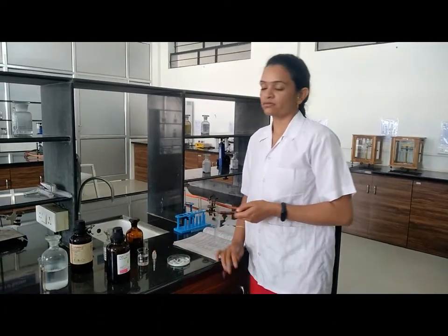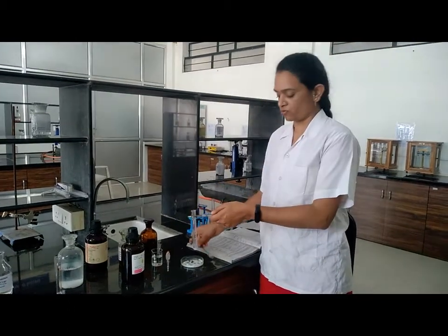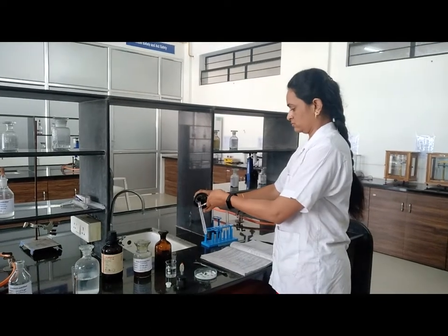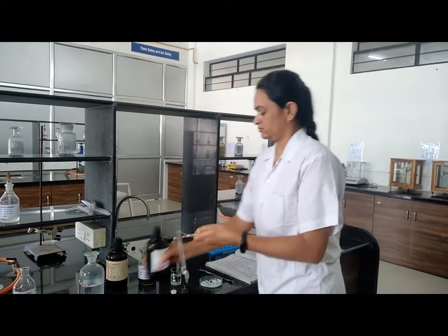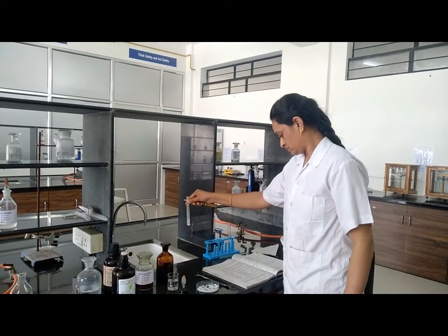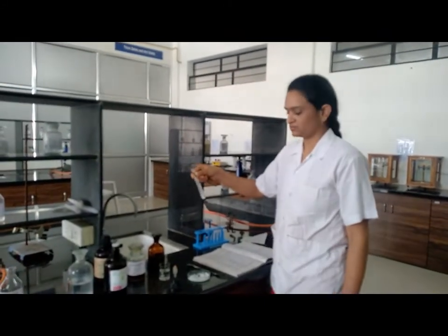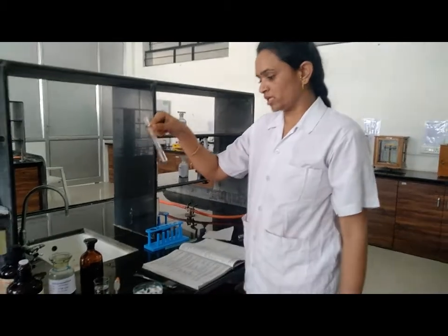Now we are going to perform solubility test in chloroform. Sample, that is aspirin in chloroform. In chloroform, it is soluble.